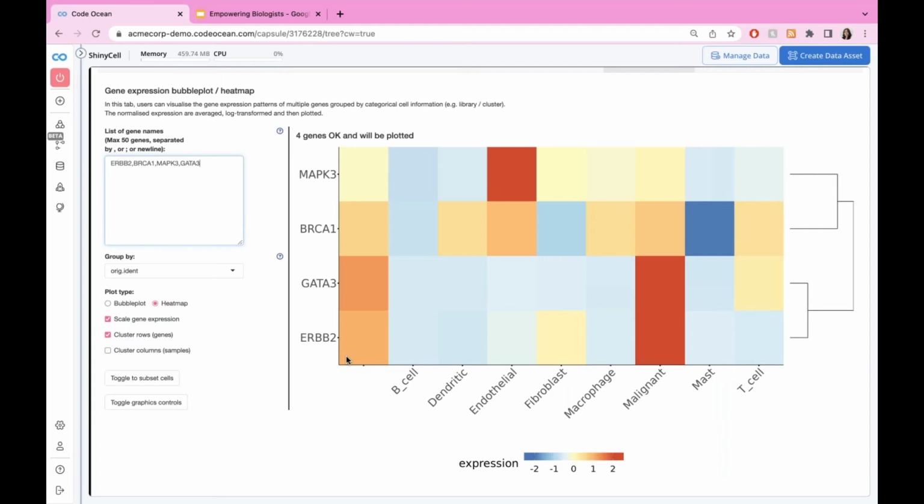This can be a load of scientific advances or scientific discoveries that you can gain from these types of plots. And this is just in generating new gene names that were not previously available. This only further broadens the horizons for the possibility of tactile data exploration and interactive analysis.